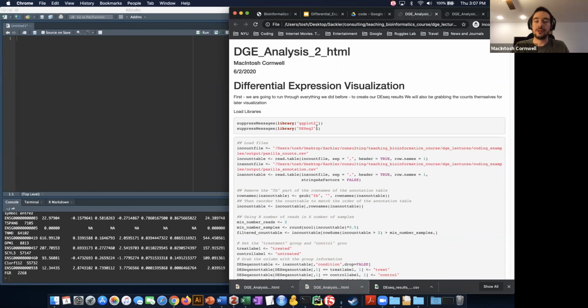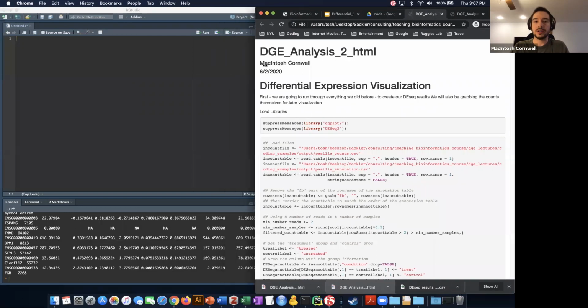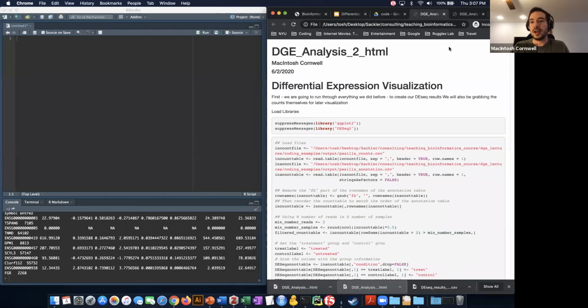analysis. We have the 3 figures here that I was talking about before. This will be a lot of just R coding that I'll be demonstrating live in this window over here. I will try and slow down on the parts that I think are confusing. And there might be some snips in here that will be a little more complicated, but I just won't spend time on because they are, again, that kind of plug and play functionality, where as long as you change the parameters up top, then the rest of the code should respond accordingly.